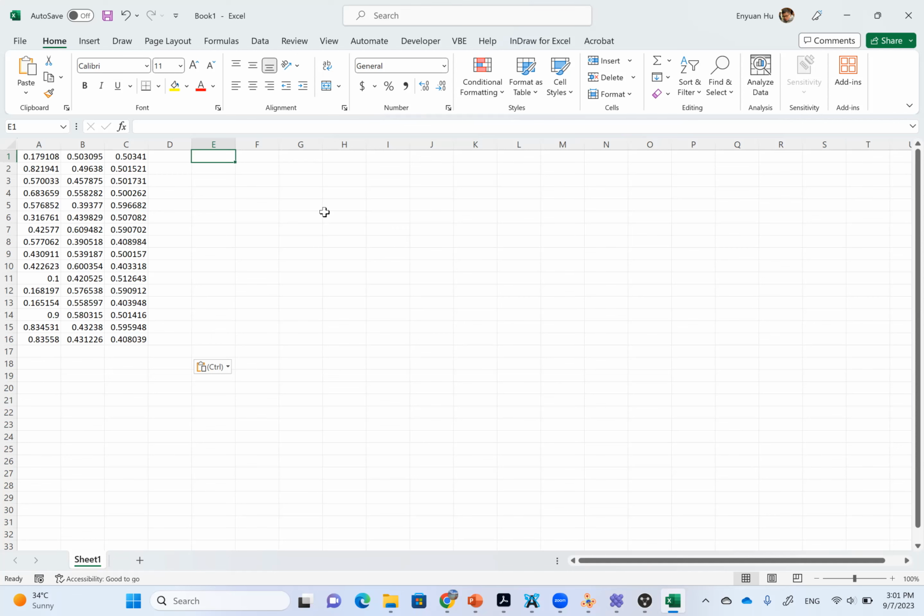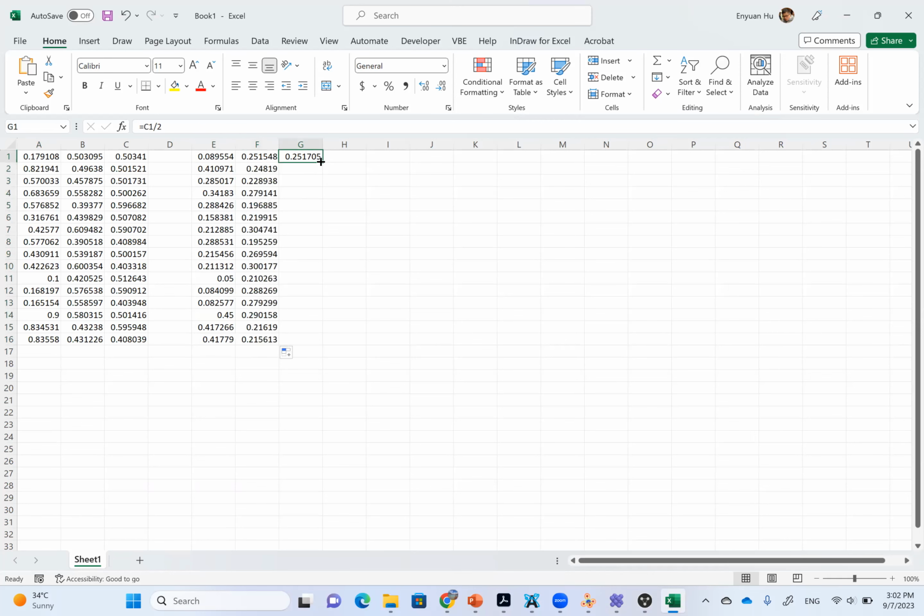So now, what should we do to the fractional coordinates? Exactly, because now the dimension has increased by 2. If we want to keep the relative position, we need to divide the fractional coordinates by 2, right? So let's do this, equals to this divided by 2, and repeat everything, all the atoms, all the directions. Okay, so these are the new numbers for the new big box.